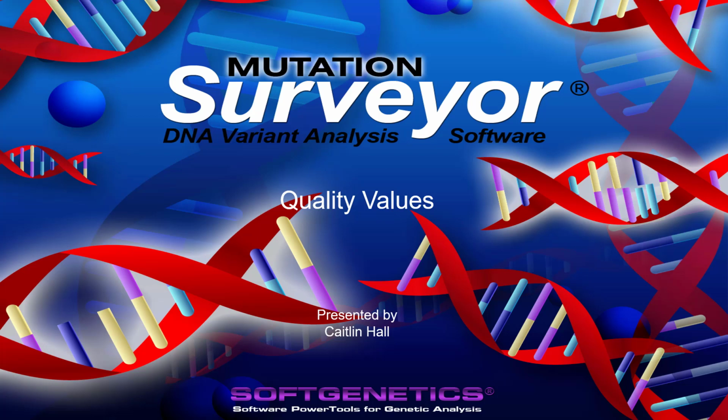Welcome once again to the Mutation Surveyor webinar series. The focus of this webinar is on quality values. We will discuss what they are, how they can be used in the software, and how to output them.